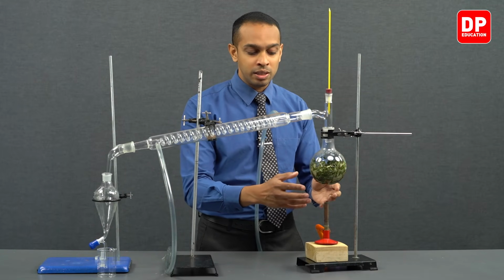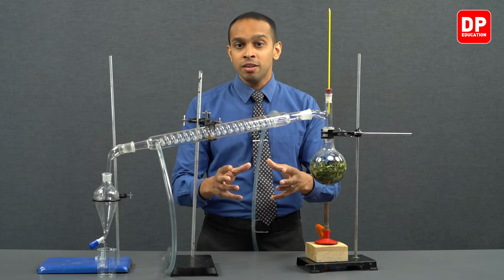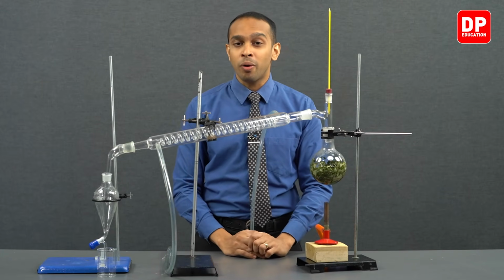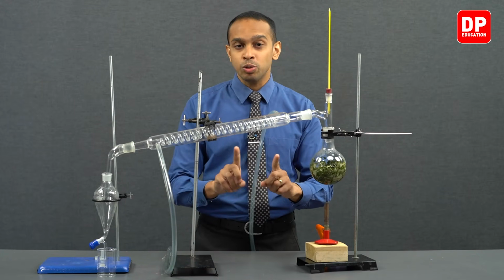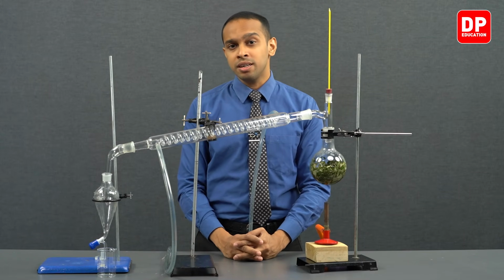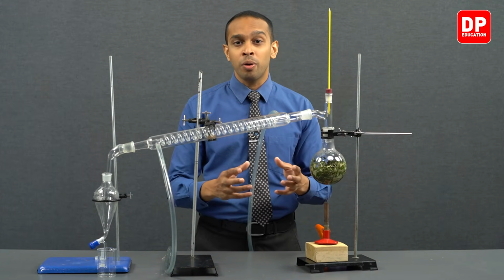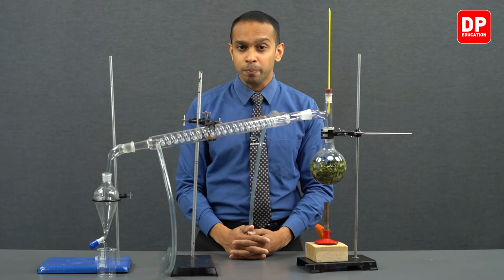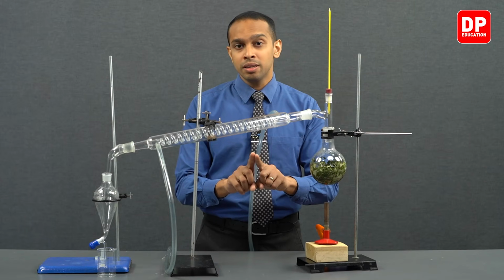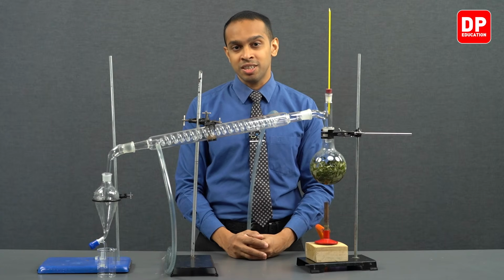And when you continue to heat this, water and the essential oil mixture will start to boil at a lower temperature than the boiling point of both of these individual components. As you know, water boils at 100 degrees Celsius, and let's assume that the essential oil boils at a higher temperature than that.